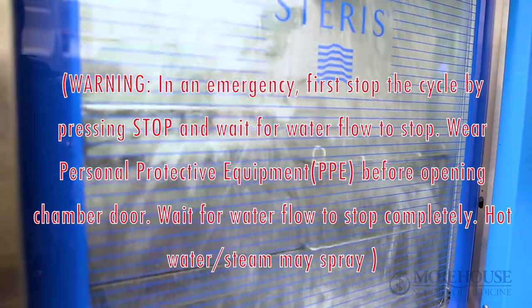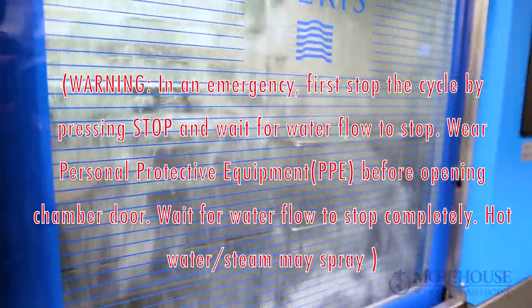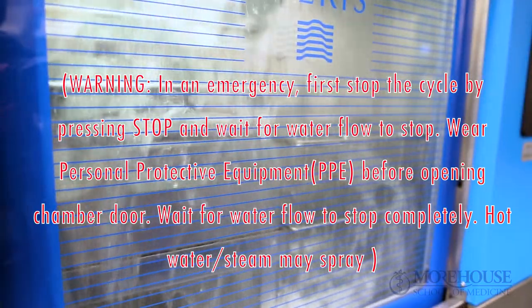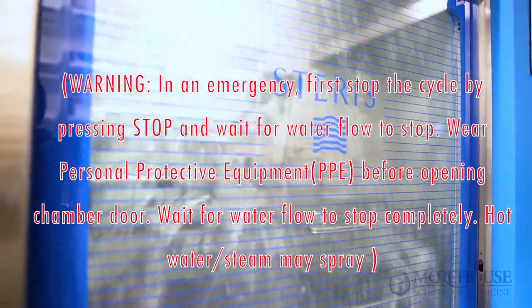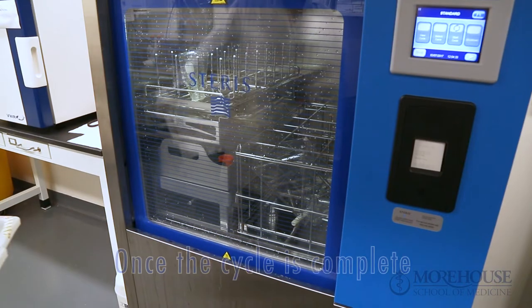Warning: in an emergency, first stop the cycle by pressing the Stop touchpad and wait for water flow to stop. Wear appropriate personal protective equipment (PPE) before opening the wash chamber door. Wait until water stops and then slowly open the door.